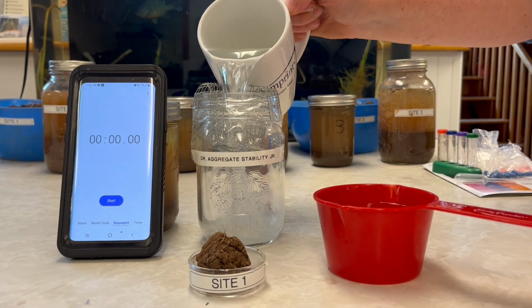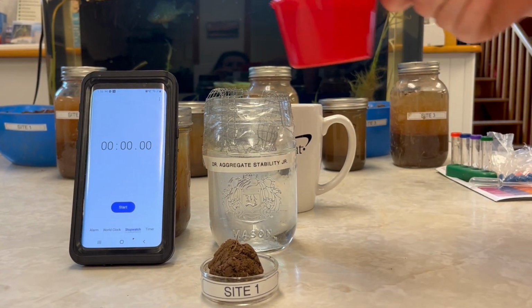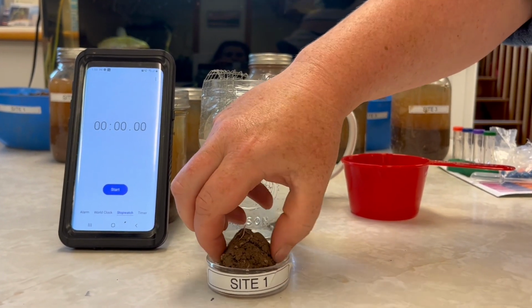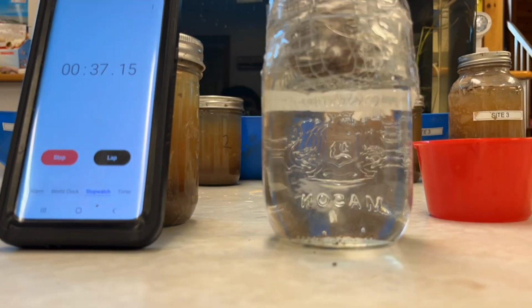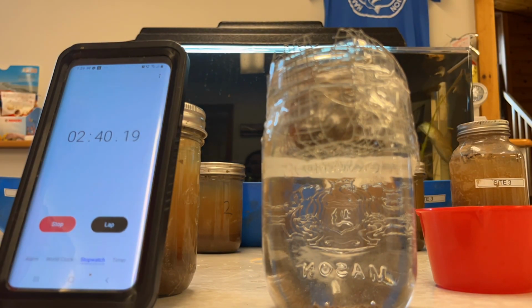For this test, you want to allow the soil to dry out for 48 hours before performing the test. Place your mesh in the top of your jar so it creates an underwater hanging basket. Place your clump in the basket and start your timer. The water will rush into the pores and break it down. Allow your timer to go for 5 minutes.